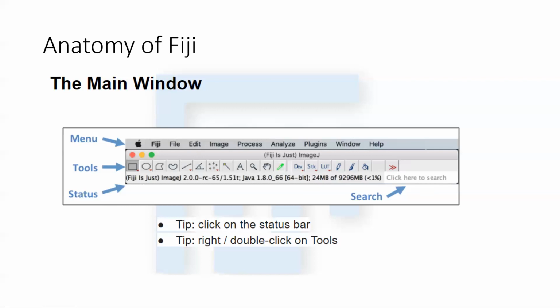which, once you get used to the terms and the plugins that you want to use more frequently, you will start using. I would say you will always use the search bar versus clicking on the menu bars and then manually going and pulling something out. That's because after a while, your hands will start to hurt with all that clicking and moving the mouse around. So knowing what operation you want to do is very helpful, because you can just type that in over here and run that plugin by itself.